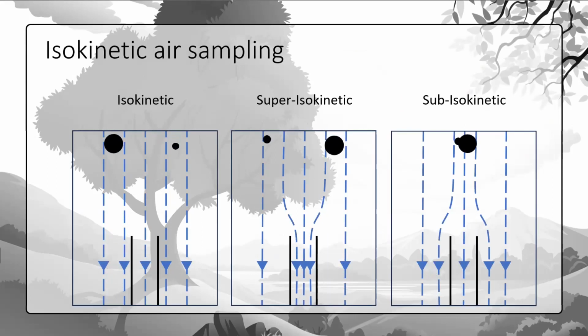So it's always the relation between the environment, the wind velocity, to the collecting velocity. If both velocities are more or less the same, then the representative amount of spores that you collected in this time frame represents quite nicely the amount of spores that are flying around in the volume that you collected.